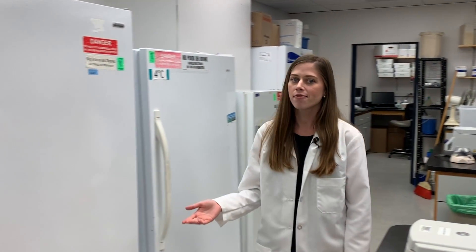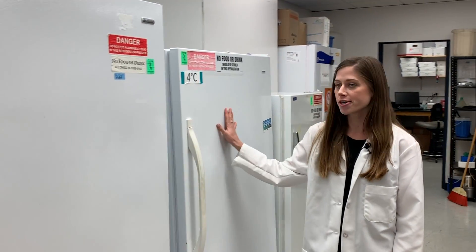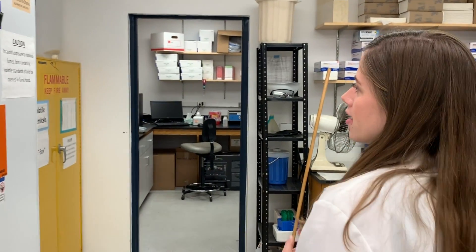Also in our lab we have a variety of different fridges and freezers at negative 20 degrees, 4 degrees, and in our other room negative 80 degrees. Different chemicals need to be kept at different temperatures in order to help stop degradation or just to store them and keep them fresh for a certain amount of time.